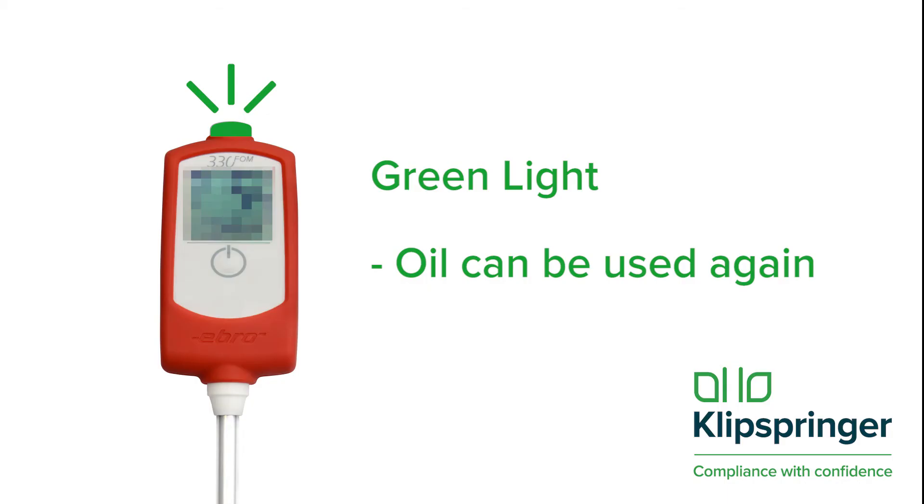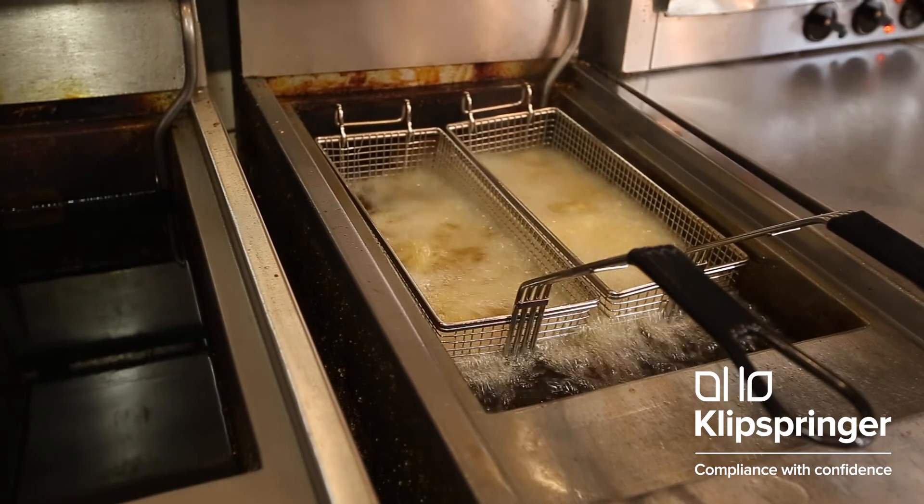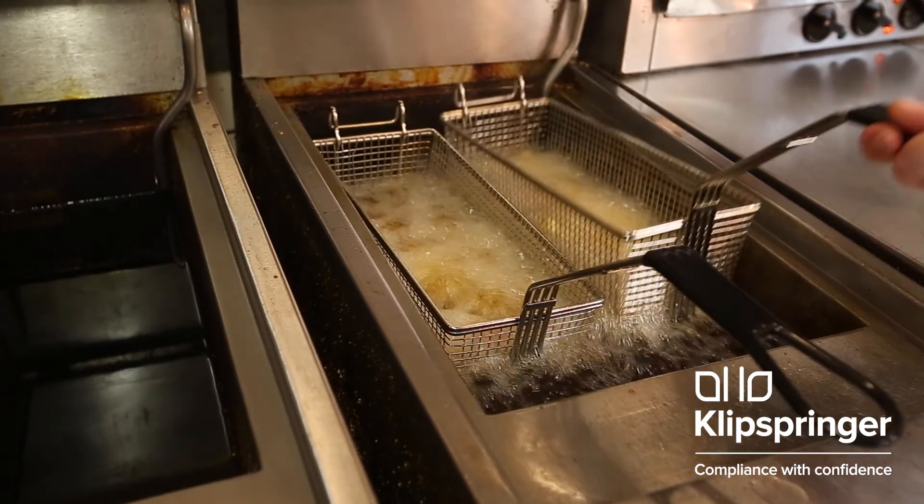If it flashes green, your oil quality is fine and can be used again. If it flashes yellow, it means your oil is getting old and will need changing soon. Think whether you will be able to get another day's use out of the oil, or does the oil need changing now?